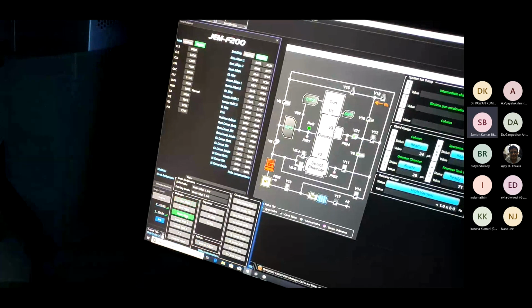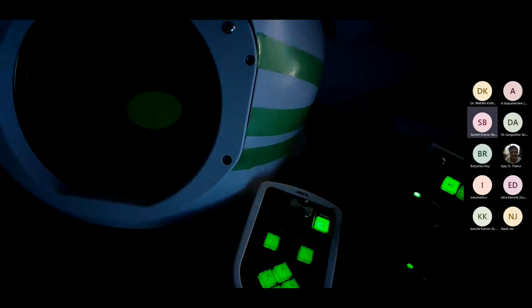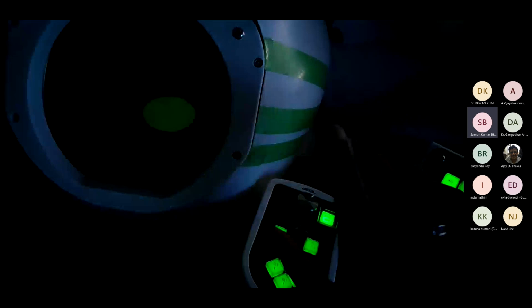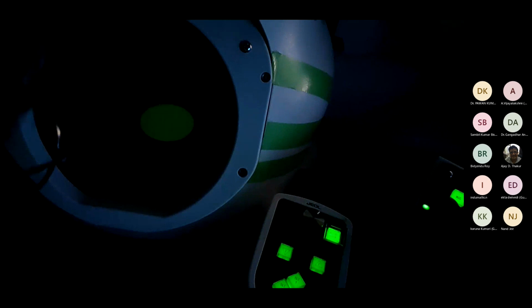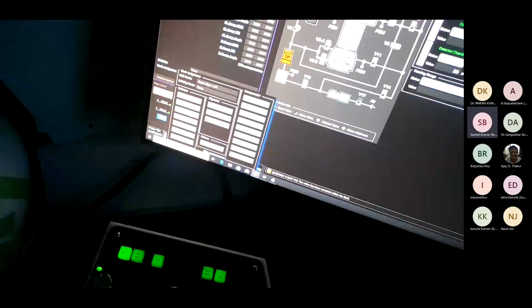Okay. So our spot is not shifted too much, so it means it is good enough. I mean, almost the beam is aligned. So using shift X, shift Y, I'm shifting the beam spot along the XY axis on the fluorescence screen. I hope you are able to see. Now again I will repeat the gun alignment.